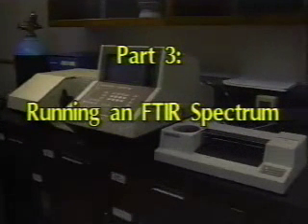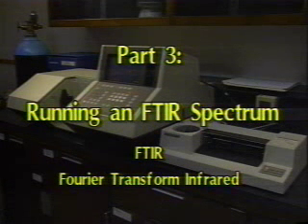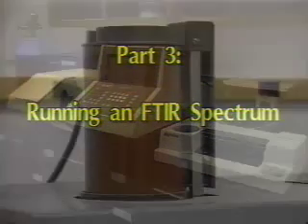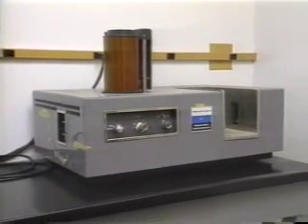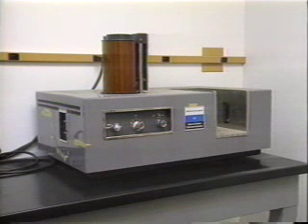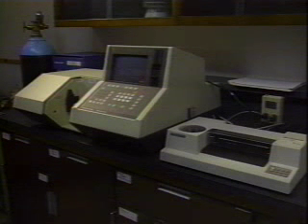Part 3: Running an FTIR Spectrum. FTIR stands for Fourier Transform Infrared. Earlier infrared spectrometers were dispersive type instruments and employed an IR light source and a grating to disperse the wavelengths. The spectrum was obtained by slowly scanning the wavelengths by moving the grating and observing absorption by the functional groups of the compound. Modern FTIR instruments employ an interferometer to observe all of the absorptions in a very short period of time.